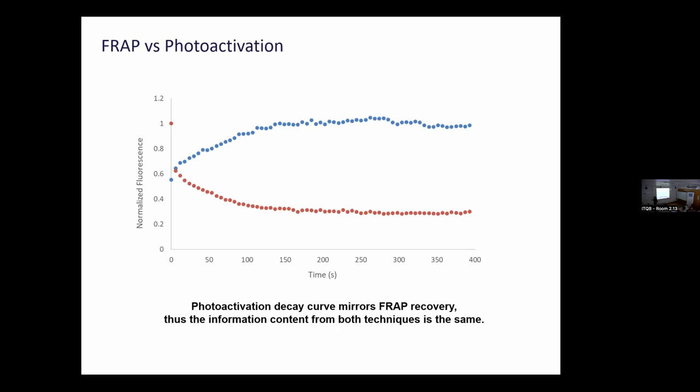It's exactly to better estimate that immobile fraction, if it exists, that the correction matters. It could be just 1% or 2%. But if you have 5% of the immobile fraction, this might become a big deal. That's why I'm calling your attention to that. It's easy to do, but to do it right, there are a lot of tiny details that we need to pay attention to. It's a fantastic idea. I show you how powerful it could be in extracting physical parameters, but it doesn't have to be that difficult.